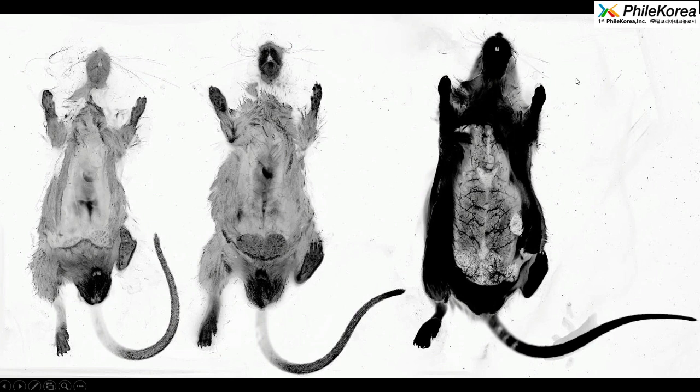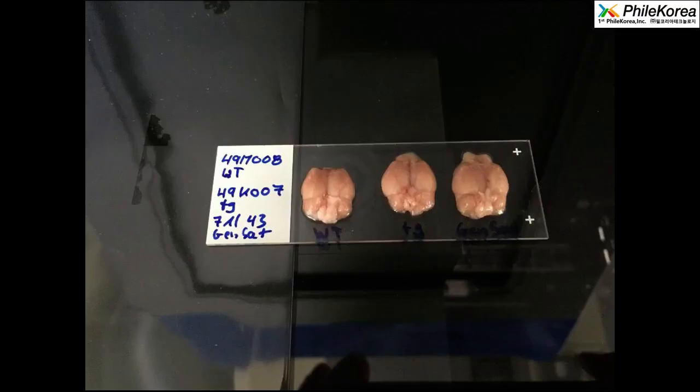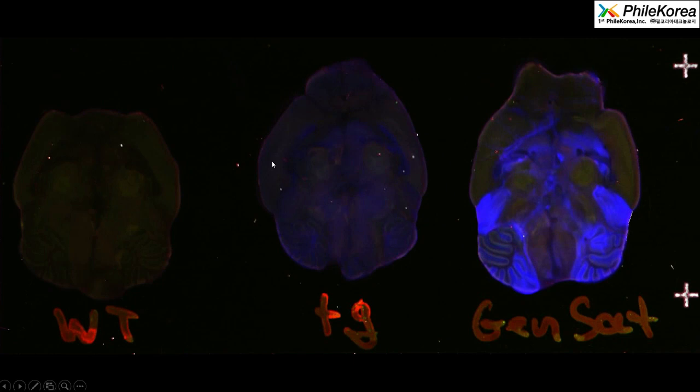And of course we were interested, is there a correlation to the brain, right? So we took out the brains of exactly these animals to check this. And look at this. So here's the wild type brain, the transgenic, and the gene-sat. And let's look at the GFP intensities. You can see here, in the wild type brain, no GFP, a bit GFP, and a lot of GFP. So there's a clear correlation to the full-size mouse scans.